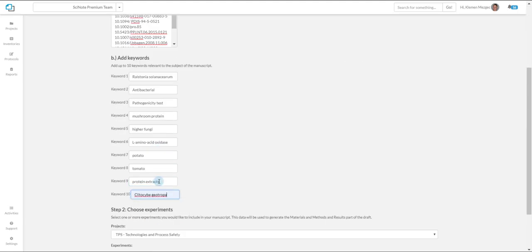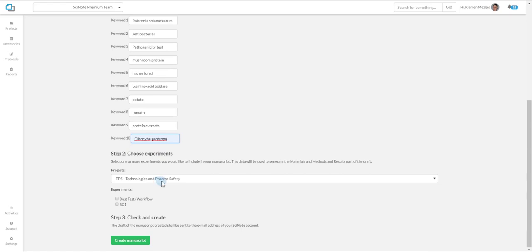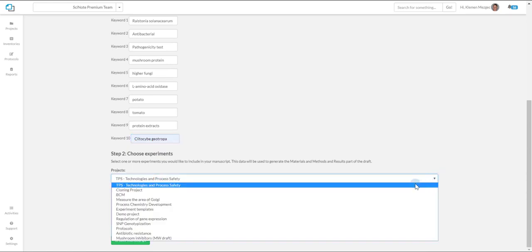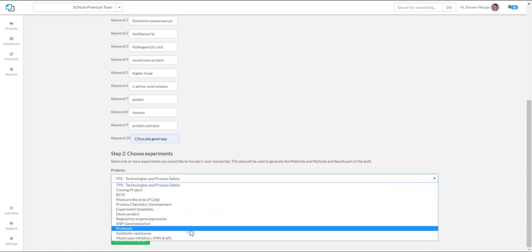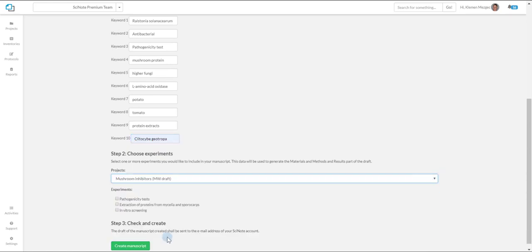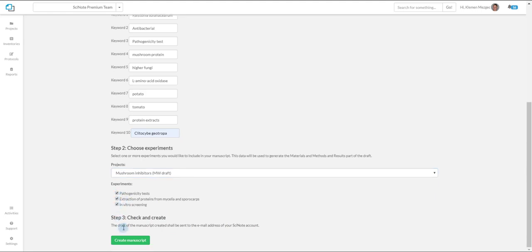When you are finished with this step, select desired project and experiments from the drop-down menu and confirm the form by clicking on the Create Manuscripts button.